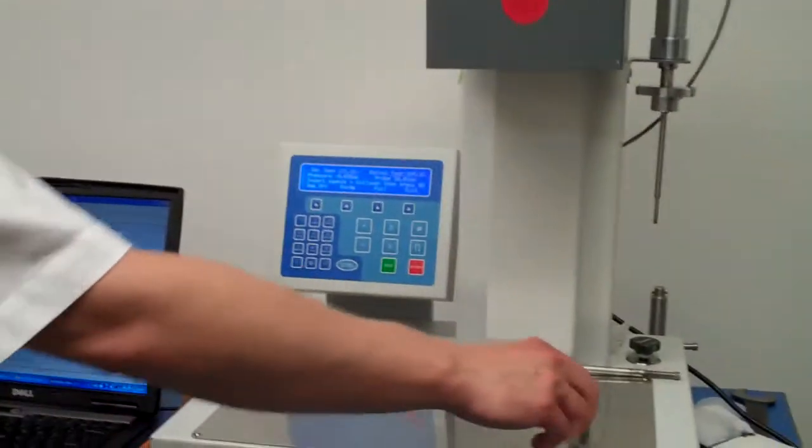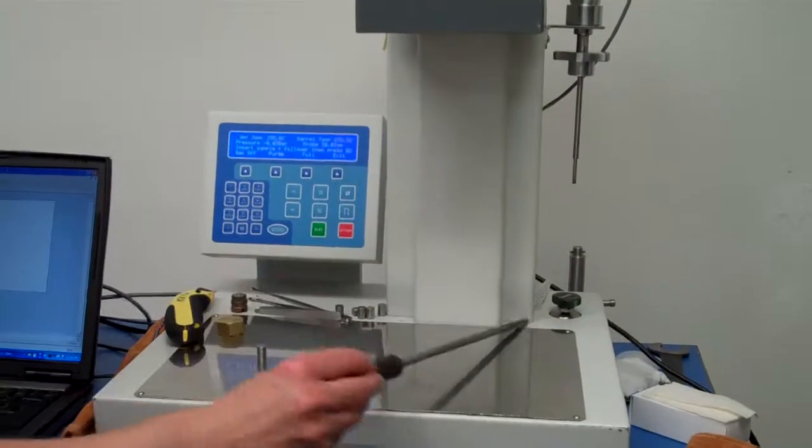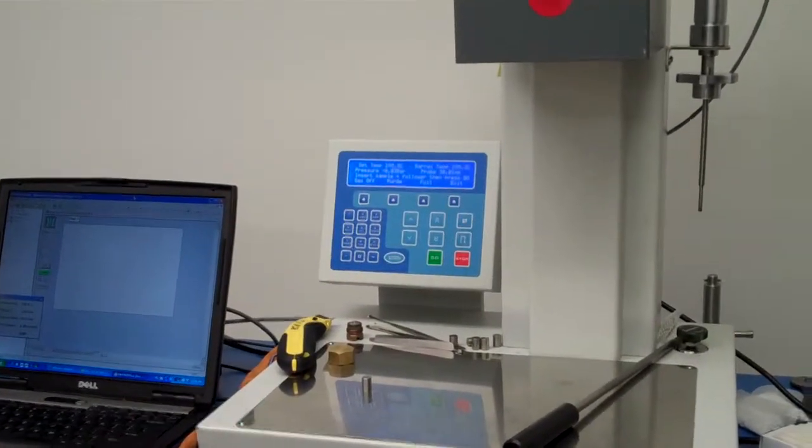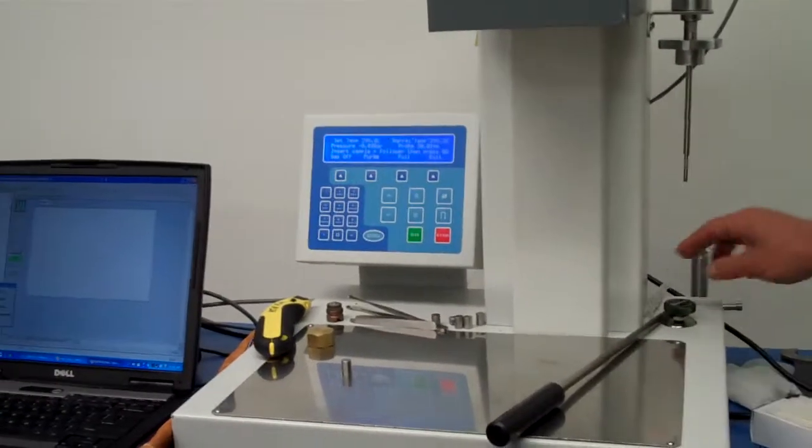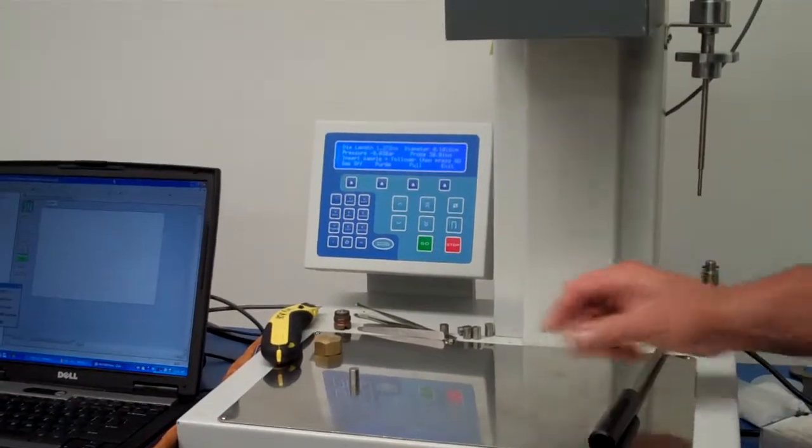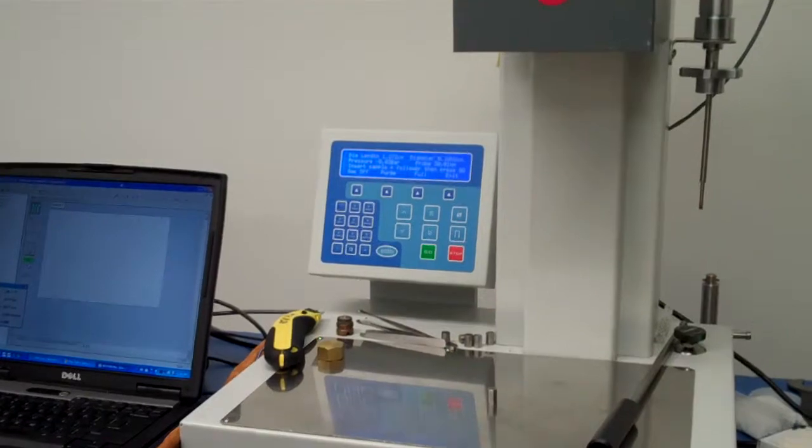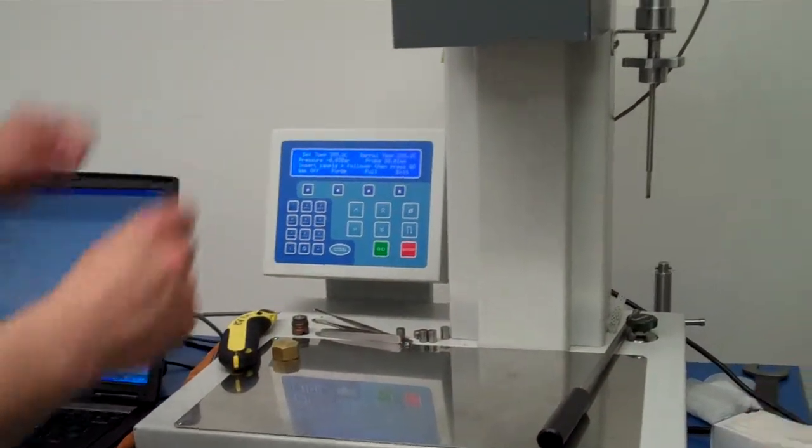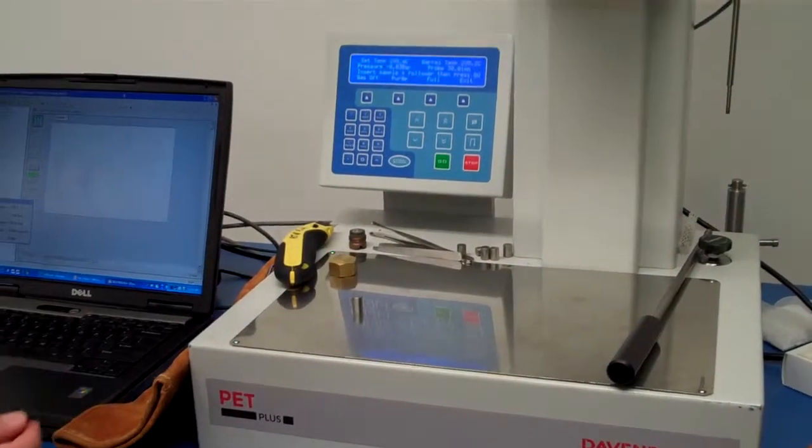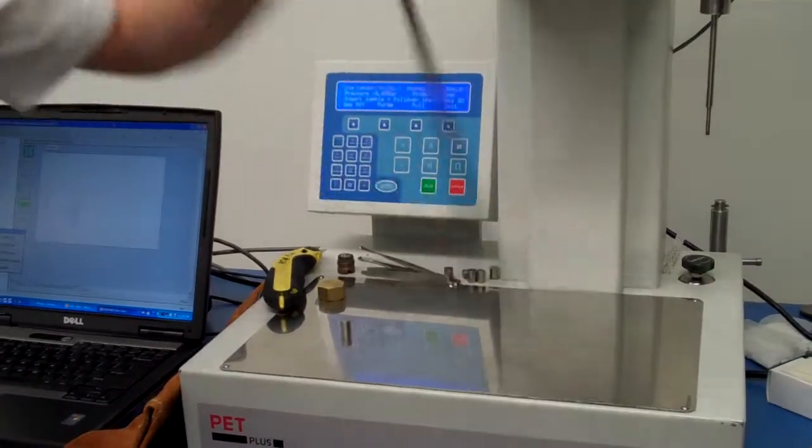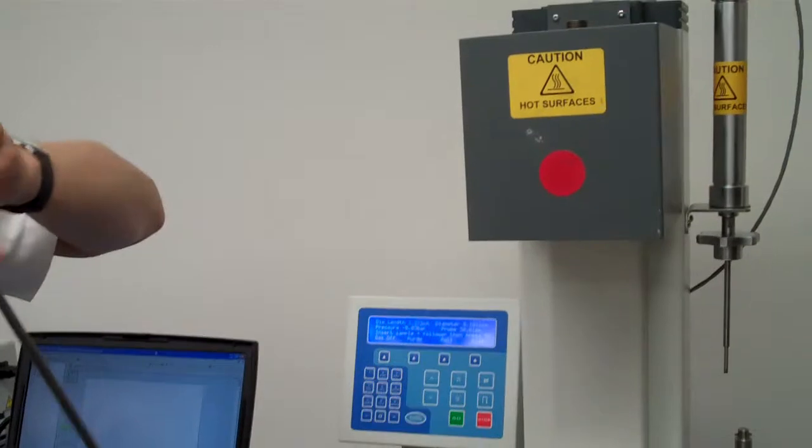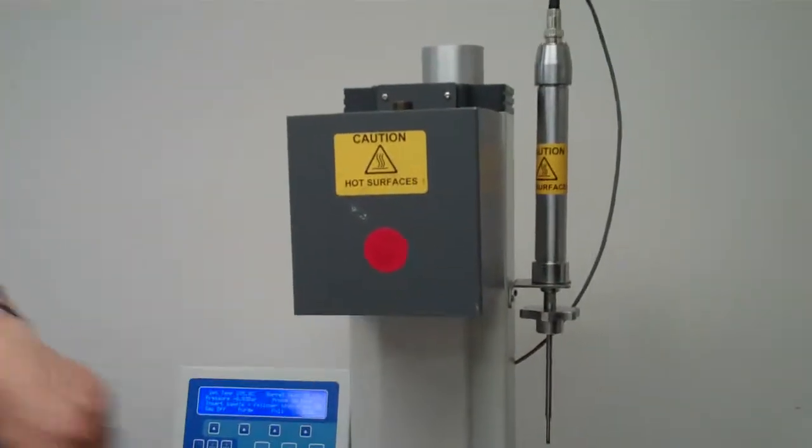And the next step is to get started. The key with this machine is to be organized and have everything ready. Because we need to transfer this into here with the minimal interruption possible. What I'm going to do next is I'm going to put it down here. We're going to put the material in, then the follower. Then we're going to take this and just hold it for a minute just while it compacts. Then we're going to fit the probe and then we're going to switch the gas on.